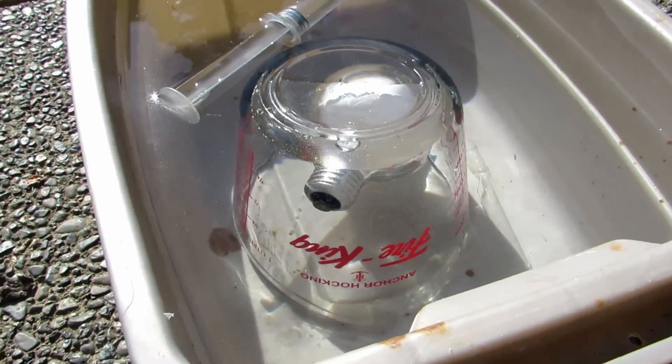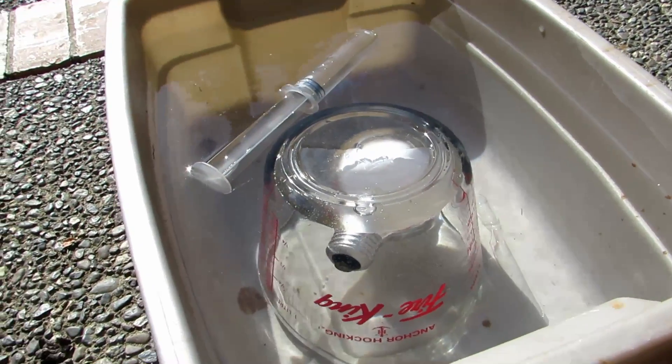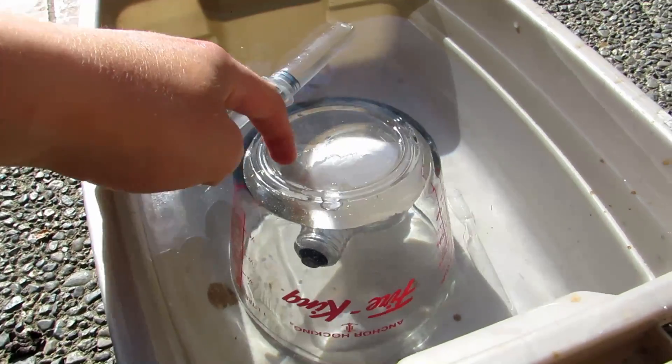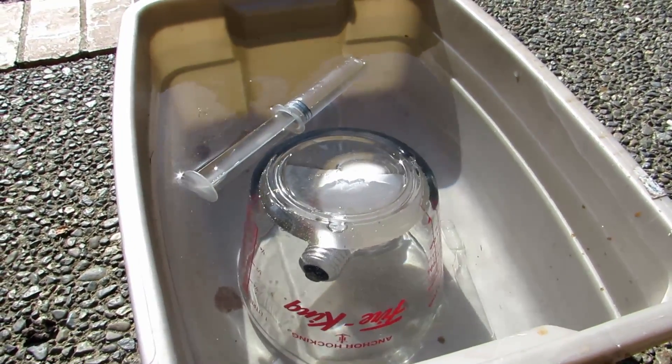The first thing to do is going to be to take a pair of channel locks or something and break that light bulb underneath this glass container, making sure that no air bubbles get in during the time. I'll be back in a moment.